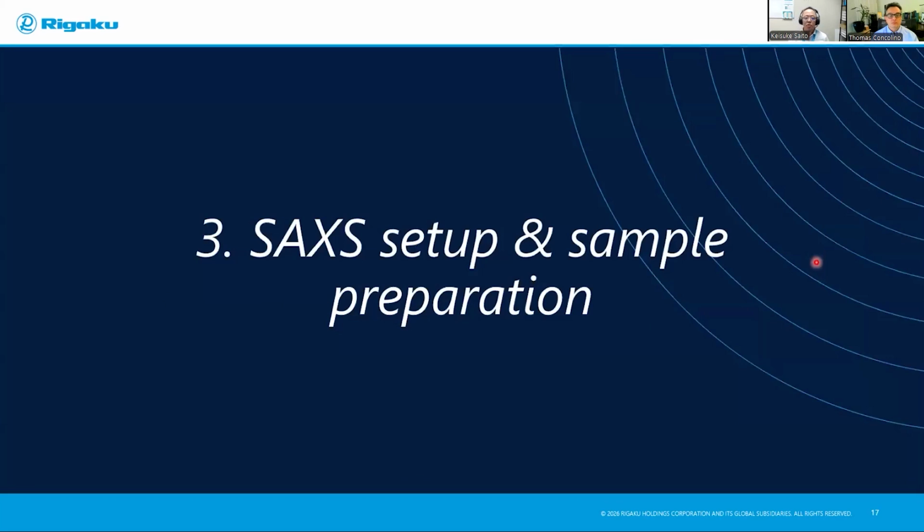Okay, before going into analysis details, let me discuss the SAXS setup and the sample preparations.